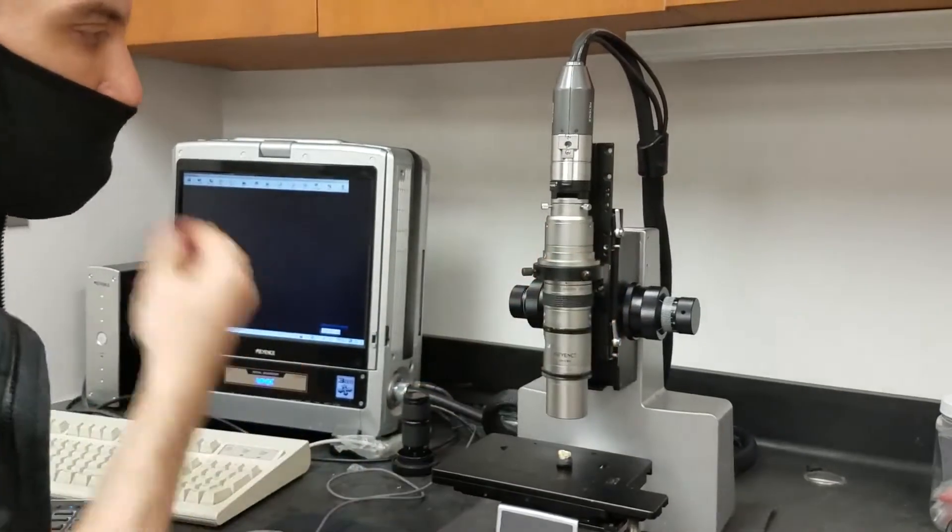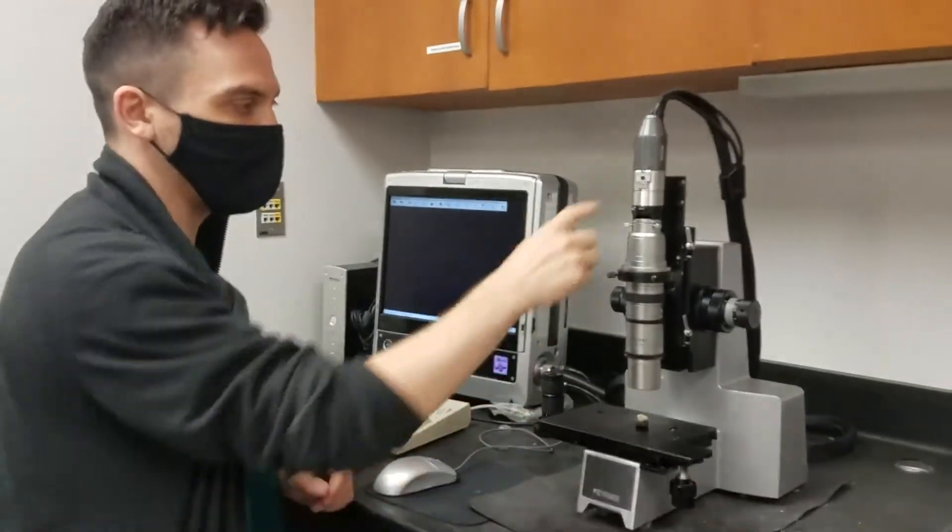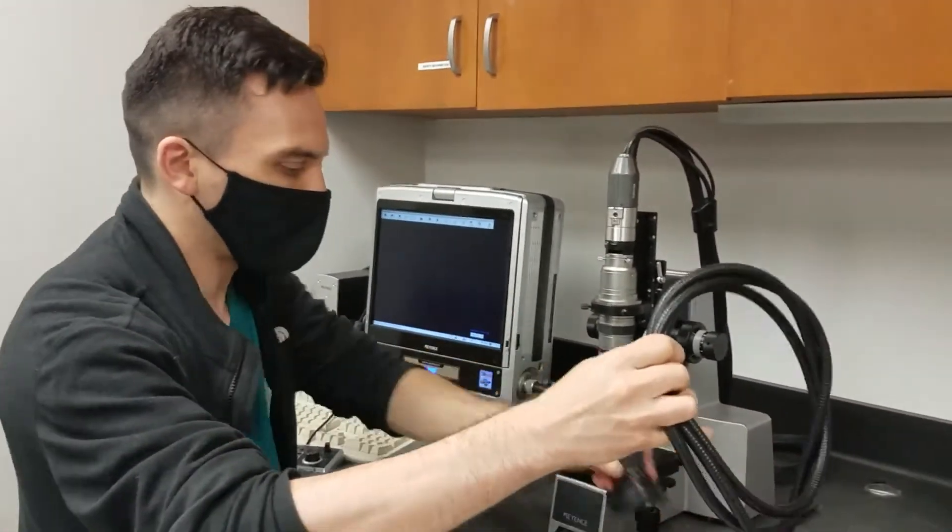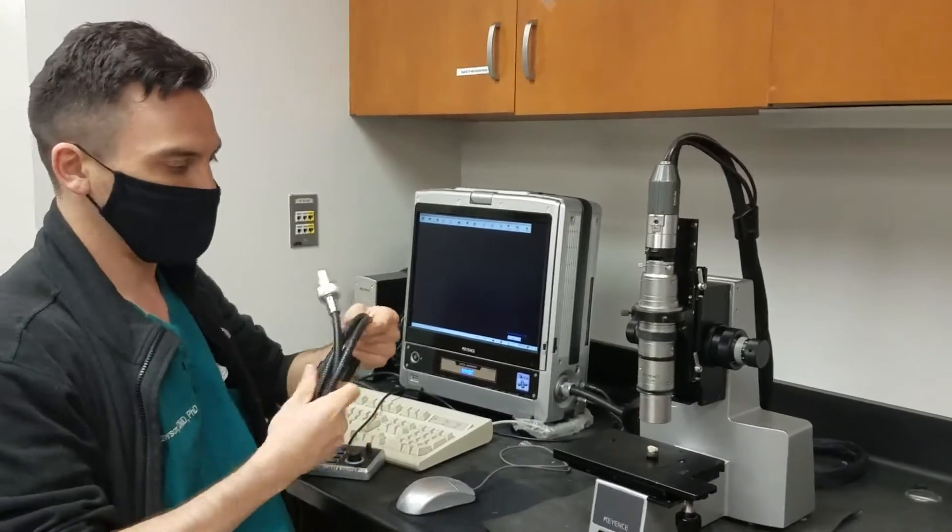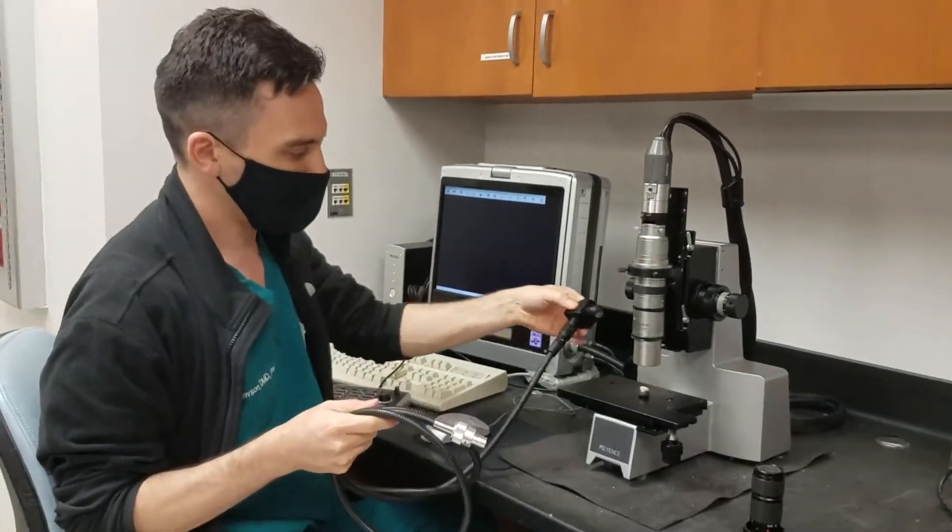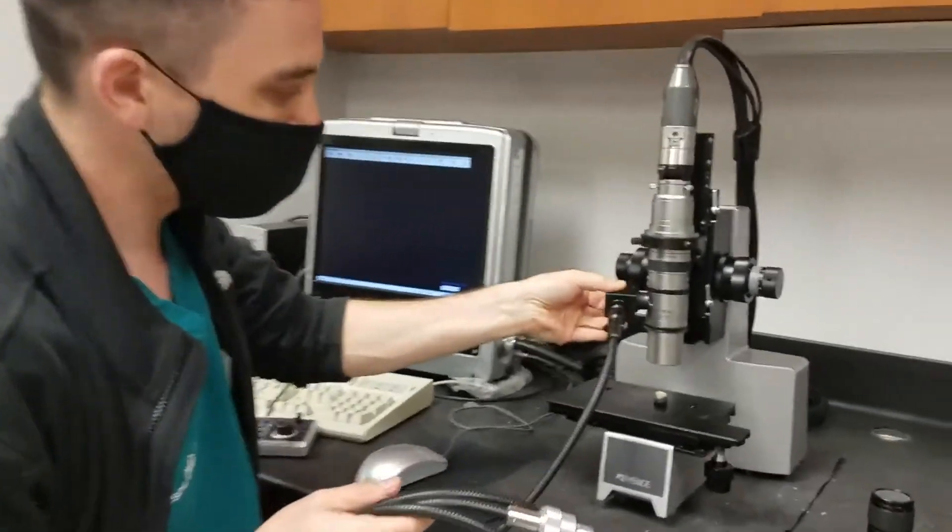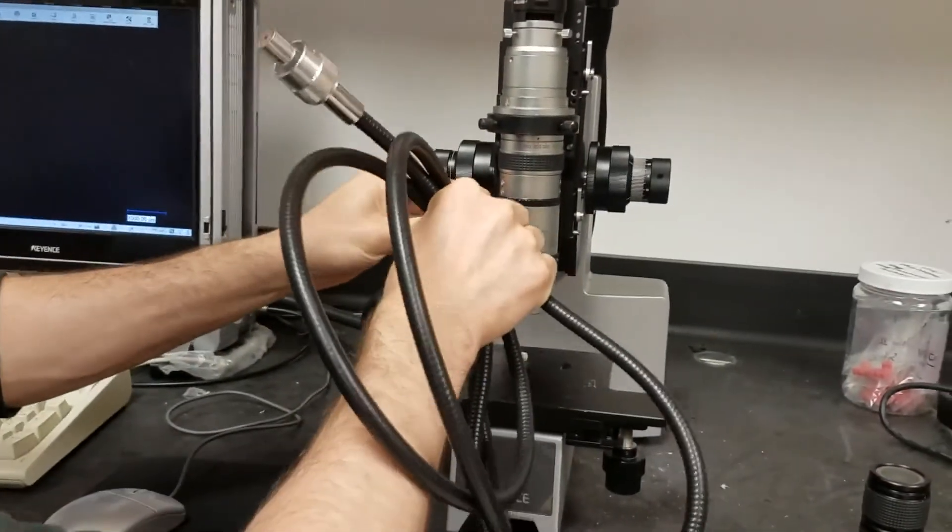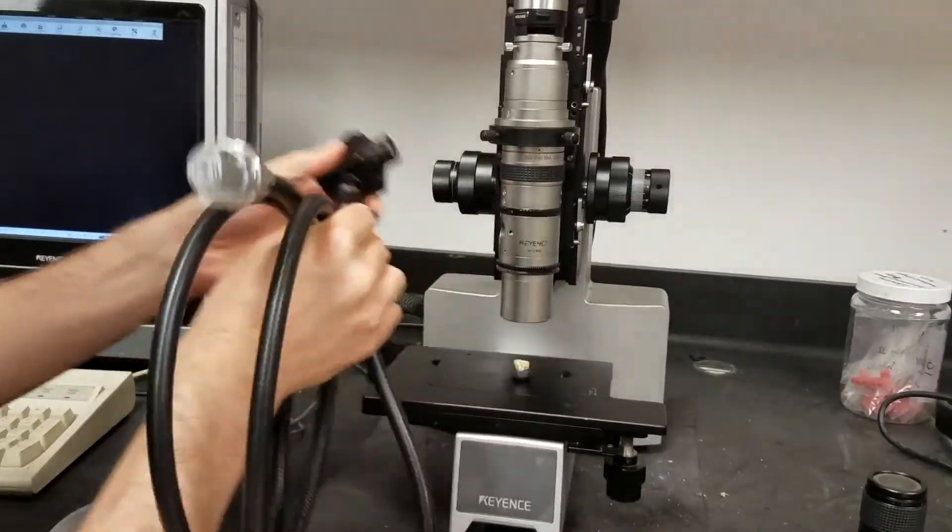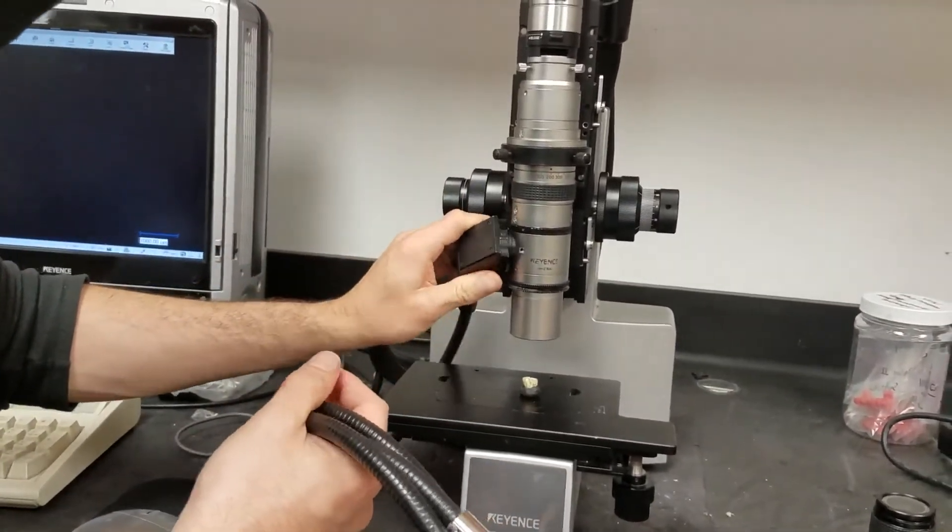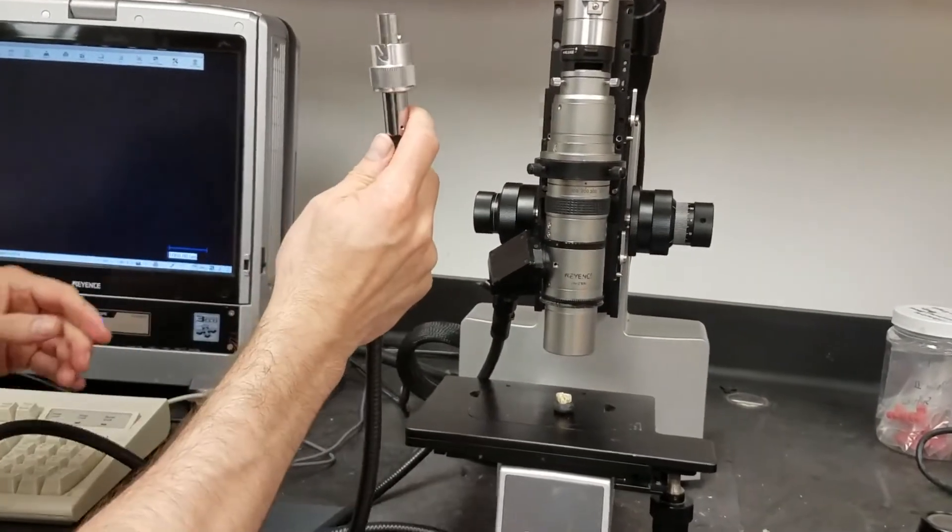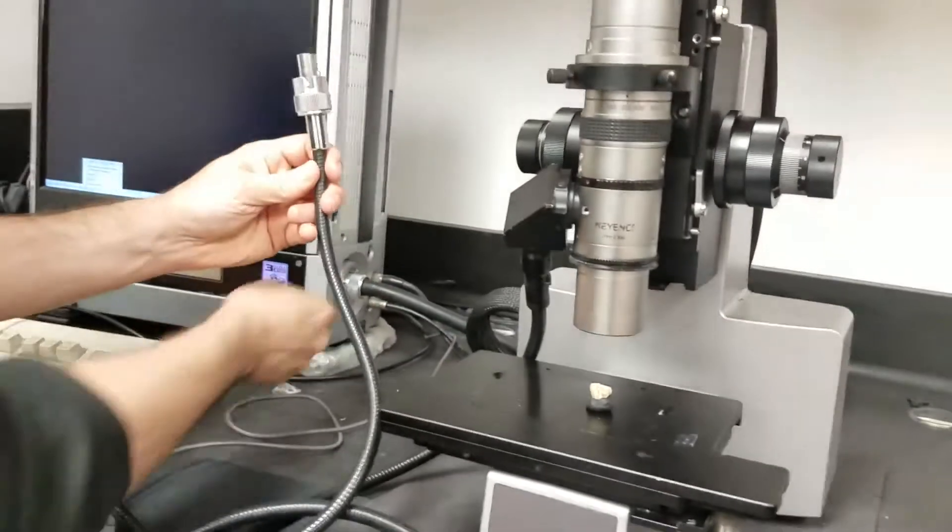And now the lighting source for the big lens is a little different. In order to get the light in here, we've got to use this separate light. So this light goes inside of here. That's a little tricky to get this in there.